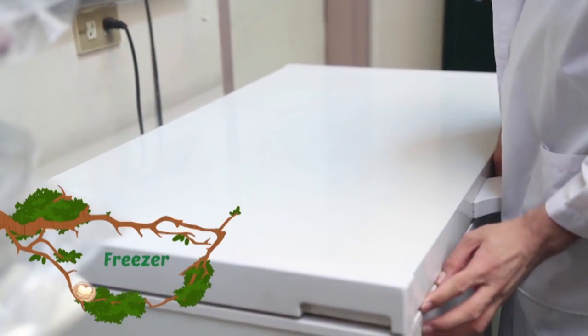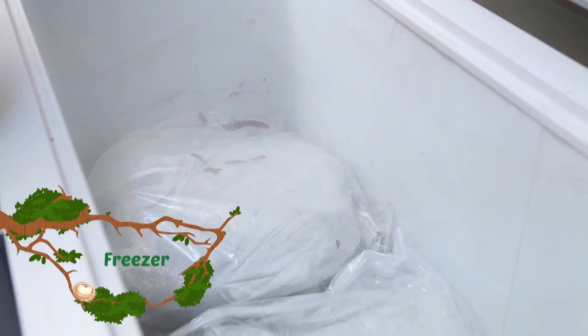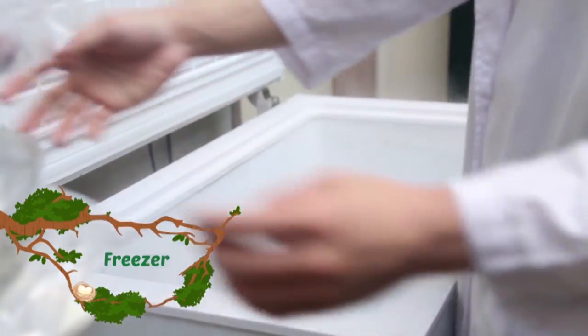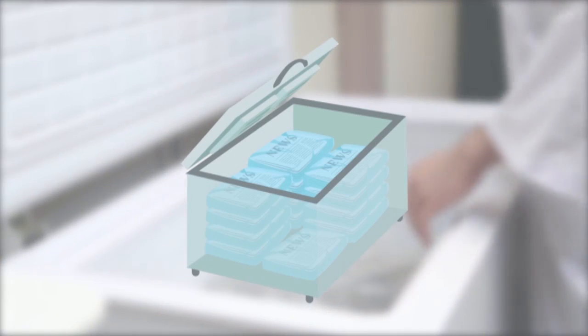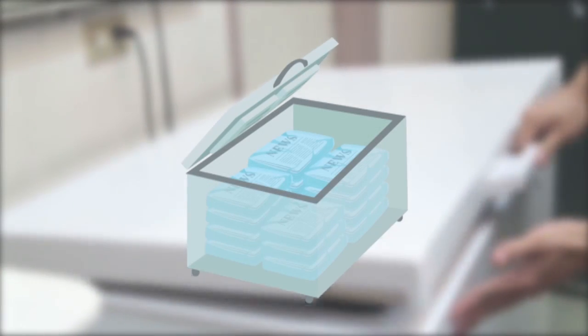Once dry, pressed specimens are placed inside freezers for two to three days. This is called deep freeze. This protects the specimens from decay and preserves them in their current state. Once preservation is finished, the specimens are now ready to be mounted for archiving purposes.